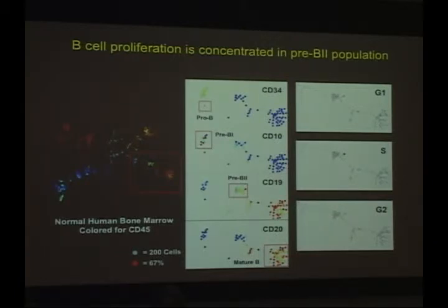And what's the rationale? What's a good logical criteria to gate these cells by regular fluorescence? You do lose scatter, and that can be important actually. A lot of the traditional gating strategies are really quite dependent on scatter. But when you have as many markers as we have, you can find lots of other things that correlate. 45 is really useful. We can get a little bit of cell size information, but we've sort of had to take what we know and make our best estimations.